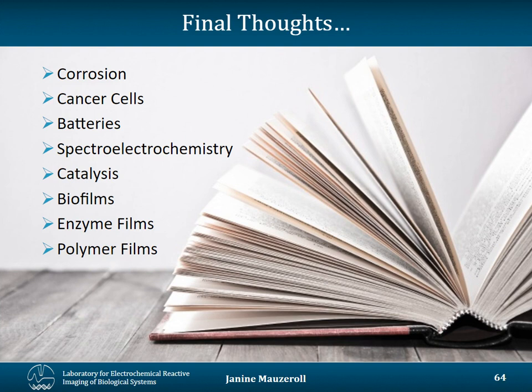And final thoughts, today I talked to you about corrosion, cancer cells, and batteries, but SECM can also be used in spectroelectrochemistry, catalysis, biofilms, enzyme films, polymer films. It's a really versatile method. And it's also easy to modify the instruments to evolve over time.